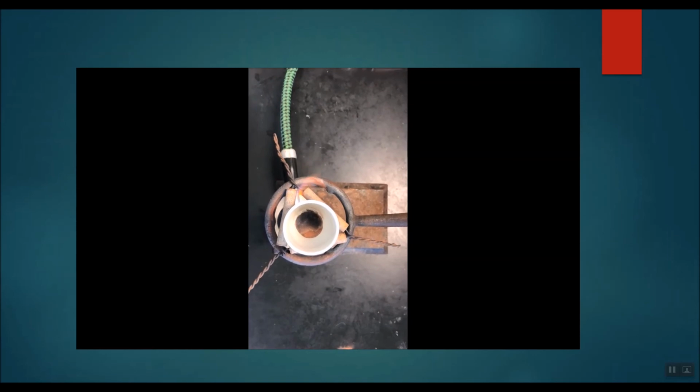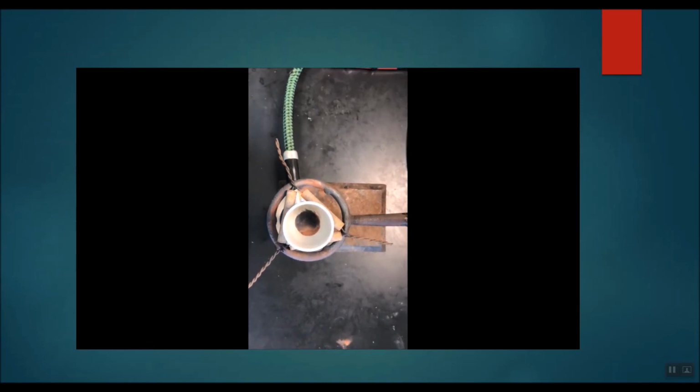You can see it darkening as the copper reacts with the oxygen.